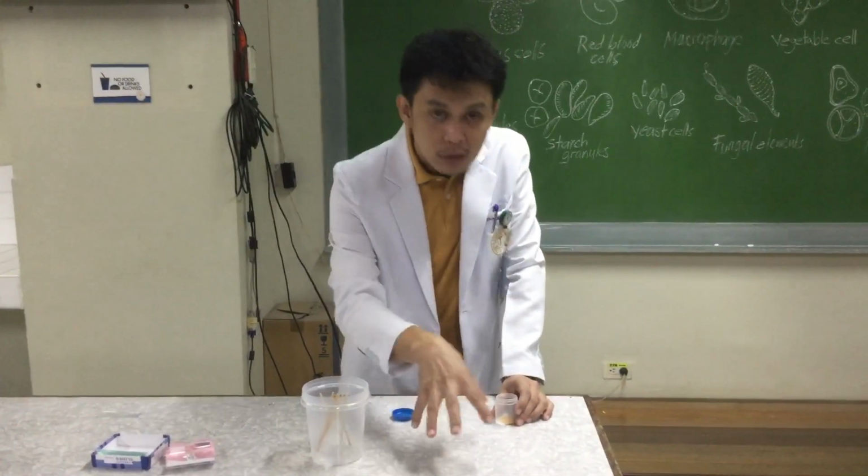Yung ibang ginagawa sa bowl eh, dun mismo pumupupo eh. Tapos sasantukin na lang kasi tatapon nyo na lang. Okay, yung iba naman sa jar yung tumatae, o di kaya papel, then kukuha ng sample. Mahirap class yung kukuha ka kasi makukontam to ng water. Kung kukuha ka ng sample dun sa mismong bowl o dun sa mismong inidoro ka kukuha. Ang tekniko nga, pumupupo ako dun sa may iba. Di ba yung bowl, may gano'n? Dun ako pumupupo, tapos doon ko kinukuha, tsaka ako ipa-flash. Kanya-kanyang technique lang yan sa pagkuha ng stool. So, that's it. That's how you prepare fecal smear.